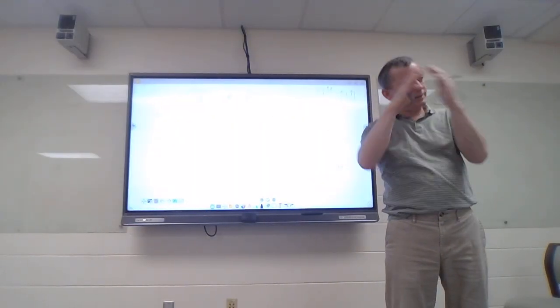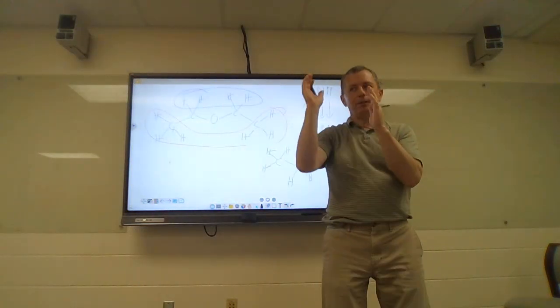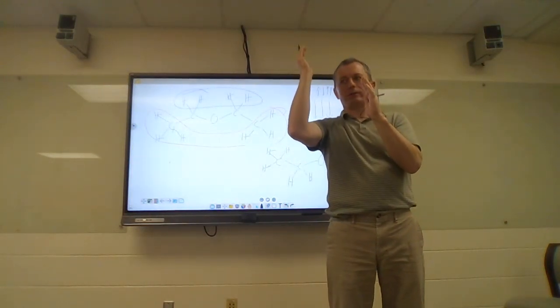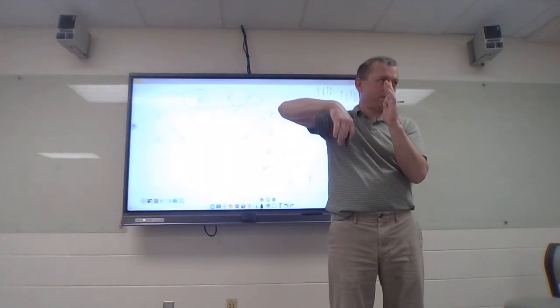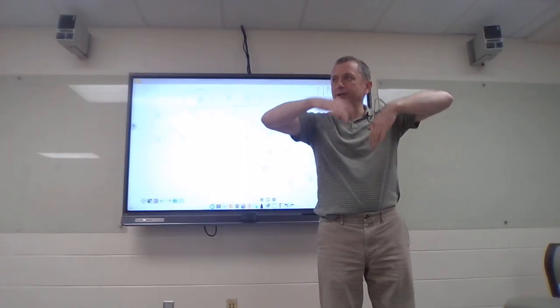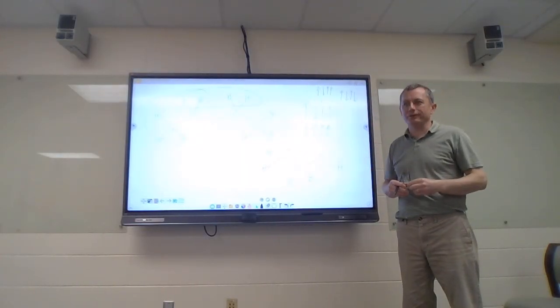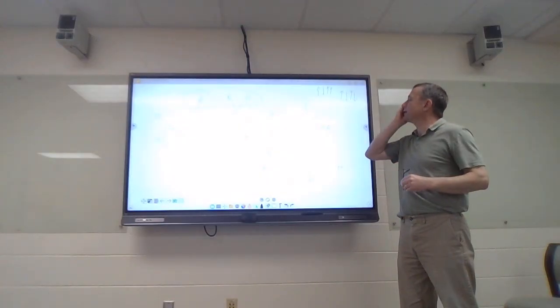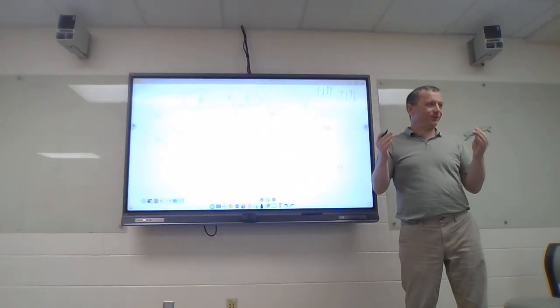And so you start to see these subtle shifts in your signal due to that neighboring nuclei, whether it's aligned with or against in a relative sense. When you think about all the probable ways that these things can align, you end up with 4 possibilities, or sorry, I should say 4 examples where their energies are different.